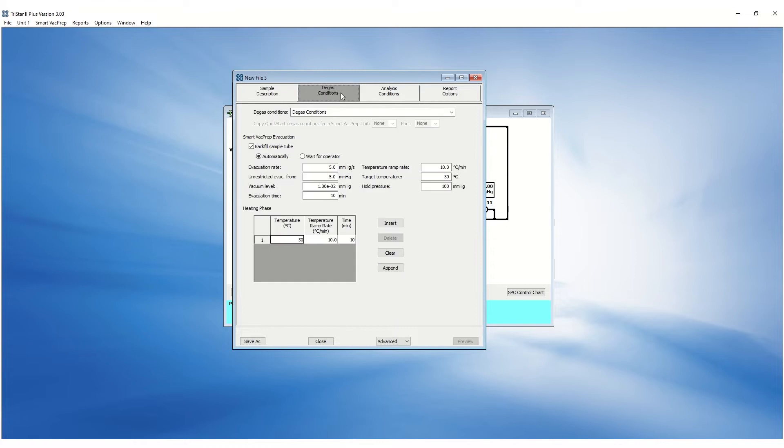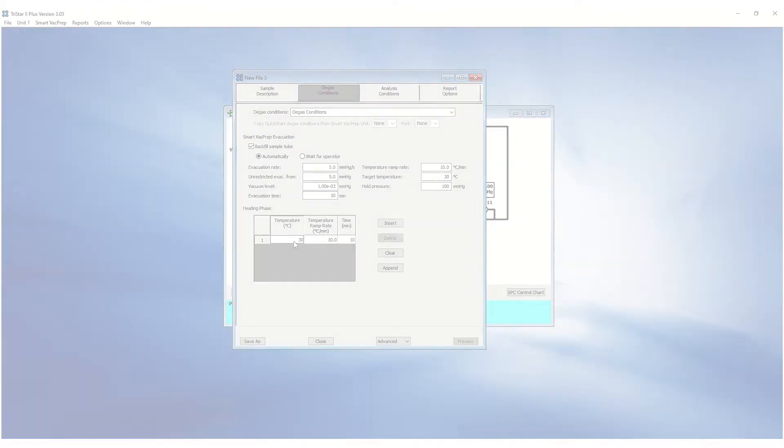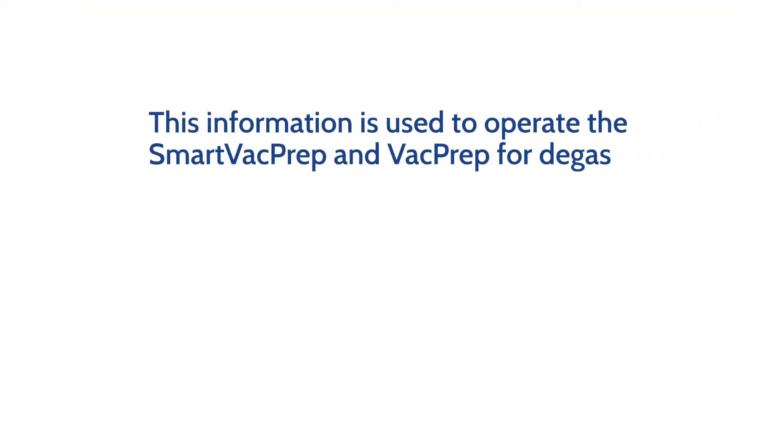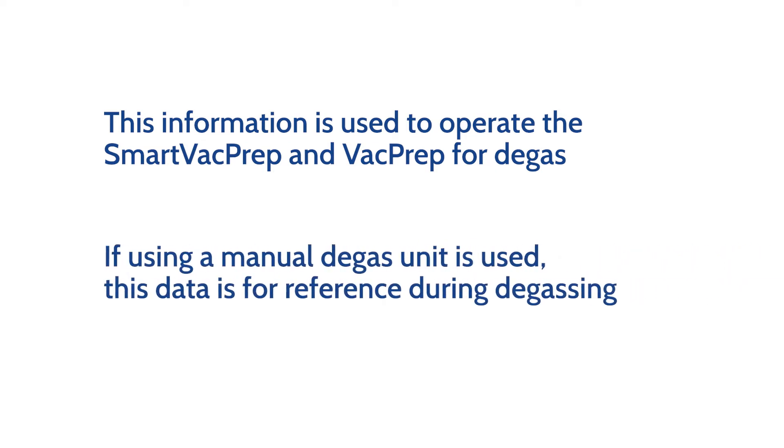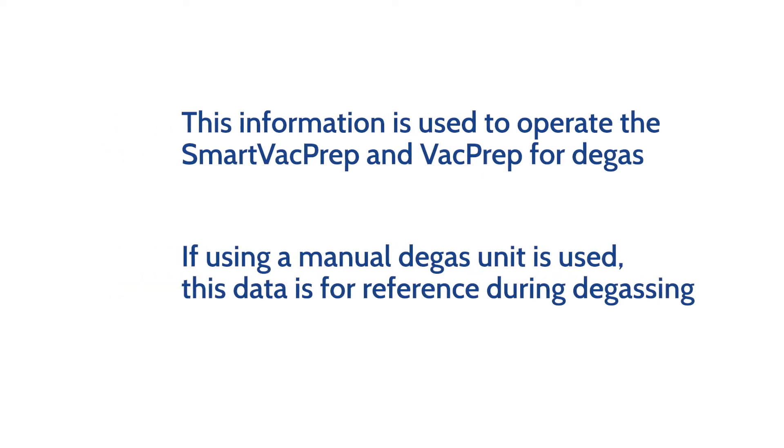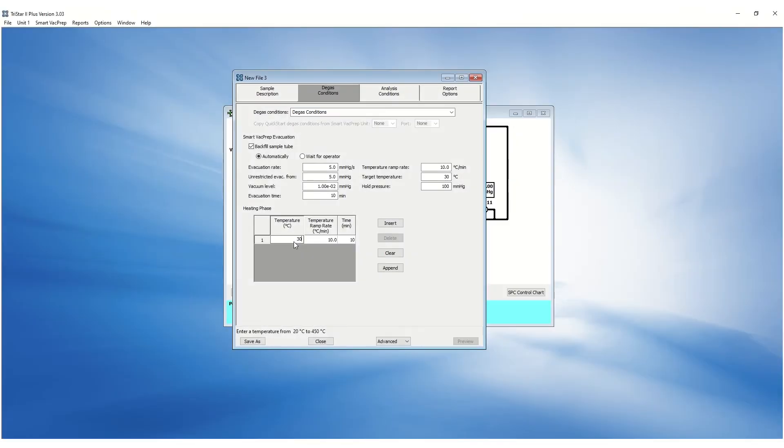The degas parameters can be entered in the degas conditions tab. This information is used to operate the smart vac prep or vac prep. If a manual degas unit is used, the information in this tab is used for reference purposes. The degas temperature, ramp rate and duration can be entered in the heating phase section.